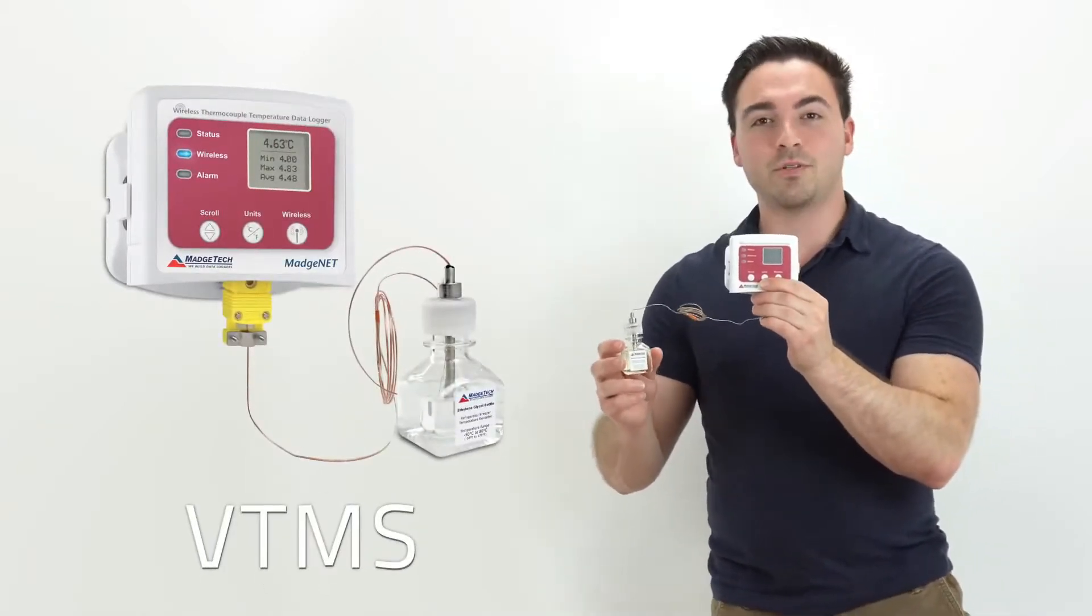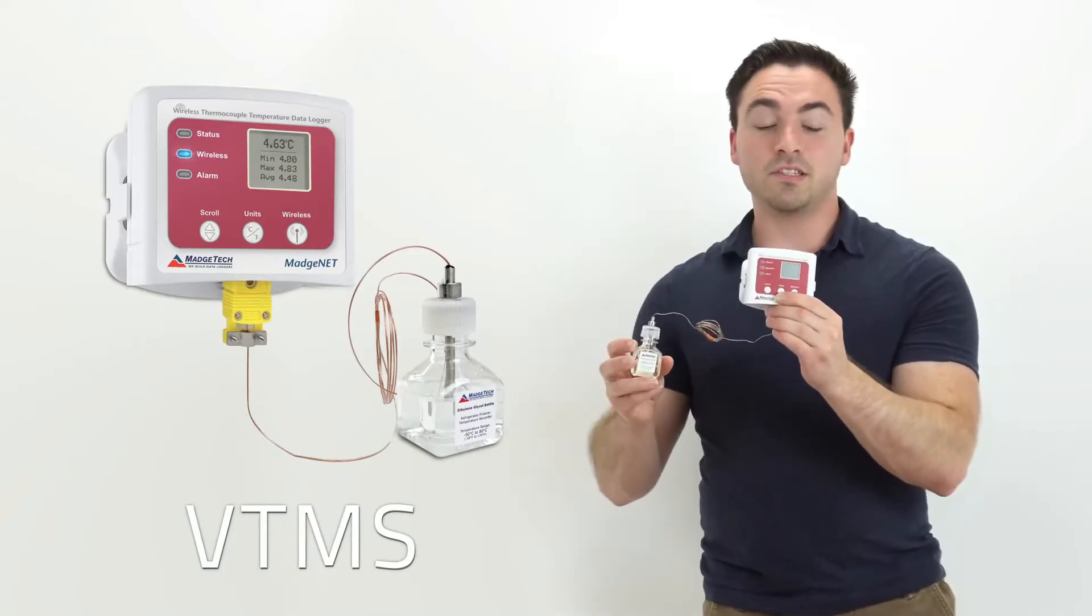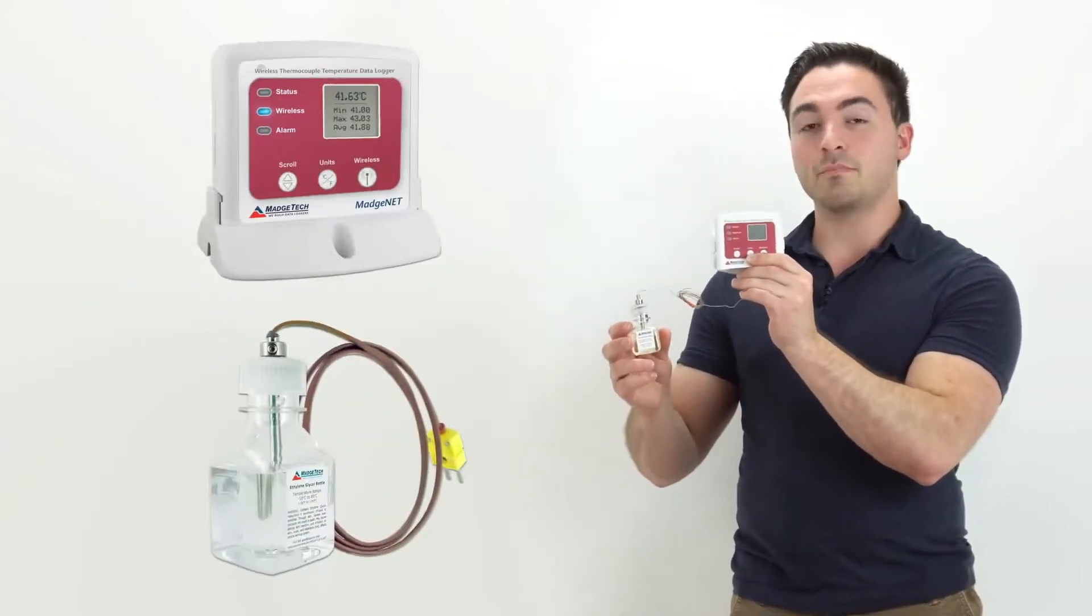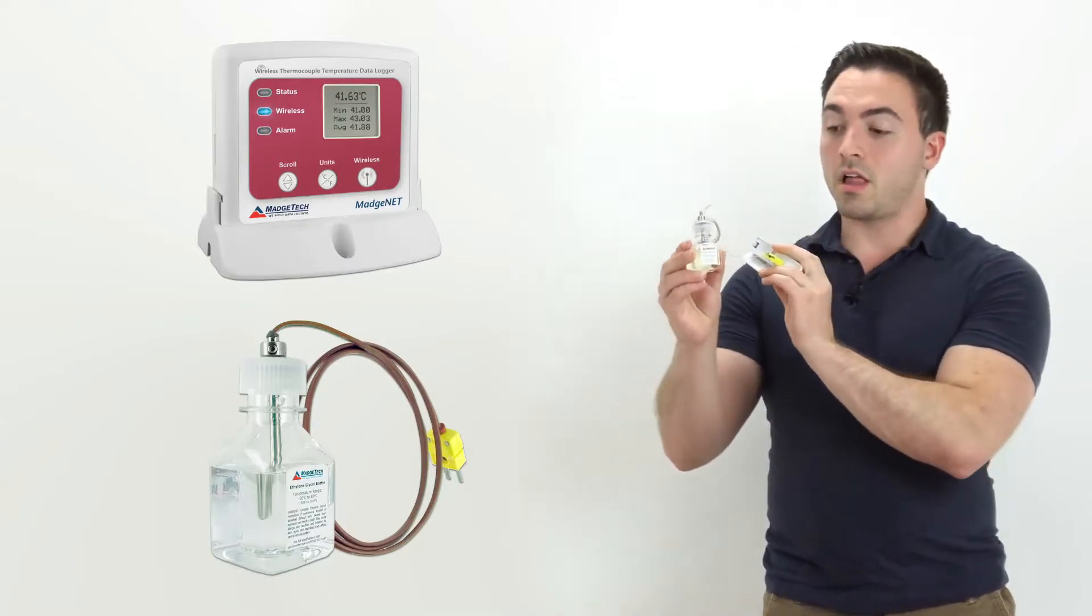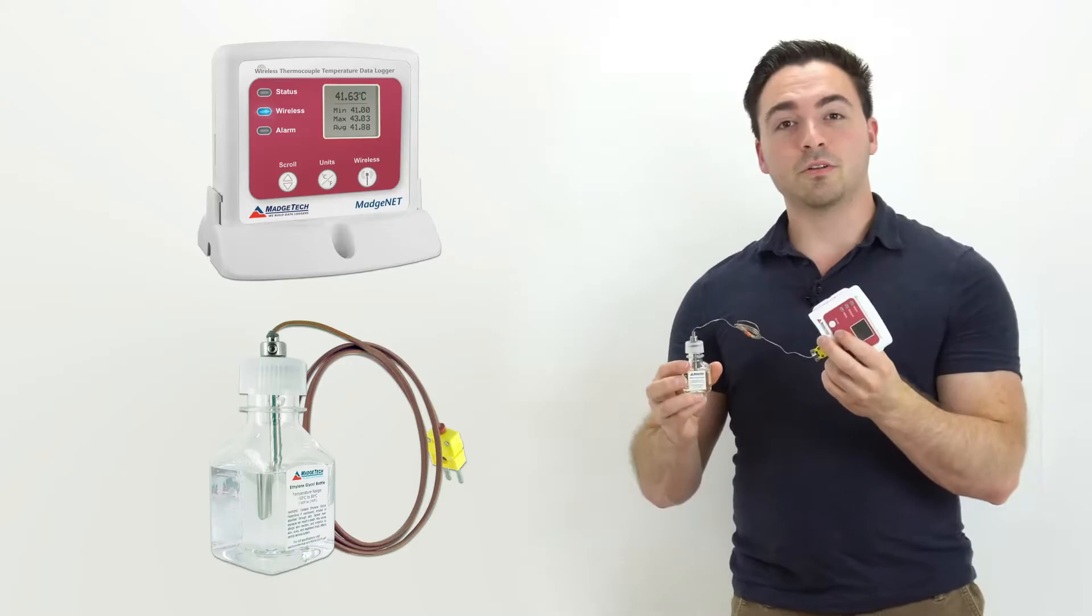VTMS stands for Vaccine Temperature Monitoring System and this system includes an RFTC temp 2000A wireless temperature data logger, a type K thermocouple, a glycol bottle as well as a power supply.